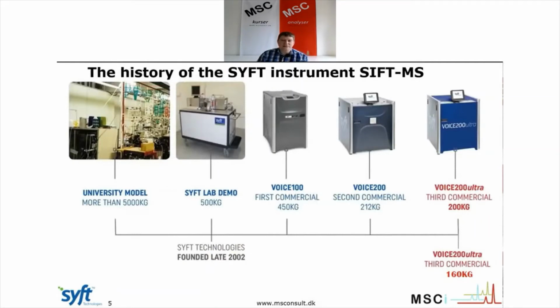The Syft-MS has been underway for a long time. The first model was a university model that weighed more than 5 tons in total. Then when they put this technology into a demo instrument, they founded the company Syft Technologies, late in 2002. Since then they've just been improving the instruments further.